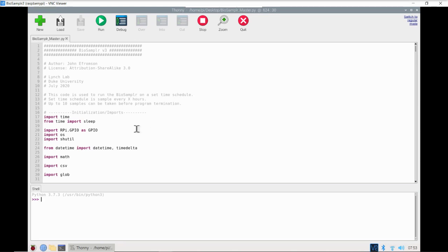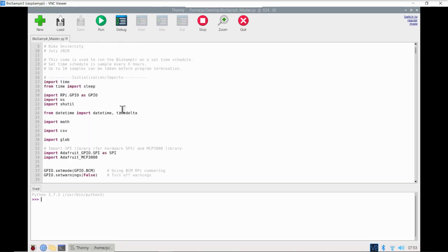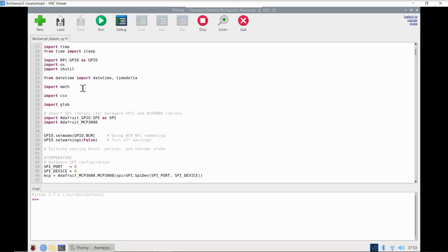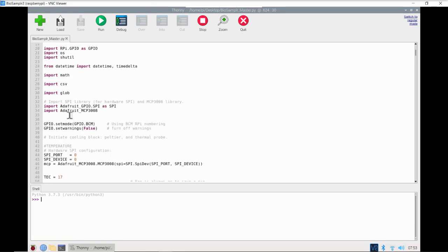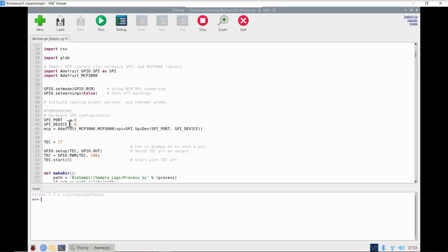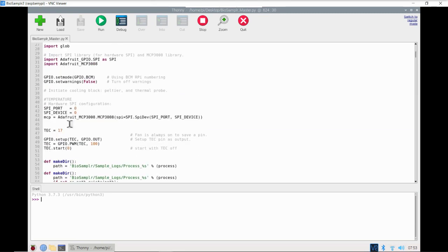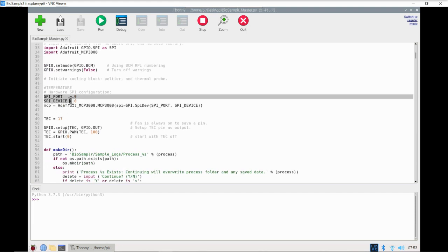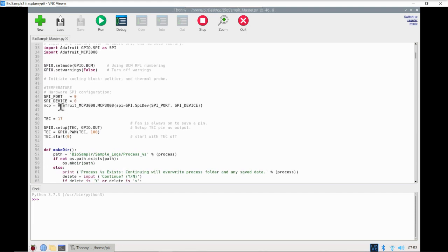The script starts here with some initialization and imports. These are different library packages that Python needs to run the script. Then we set up our SPI configuration, which runs the analog-to-digital converter chip — that's the MCP3008 analog-to-digital converter.